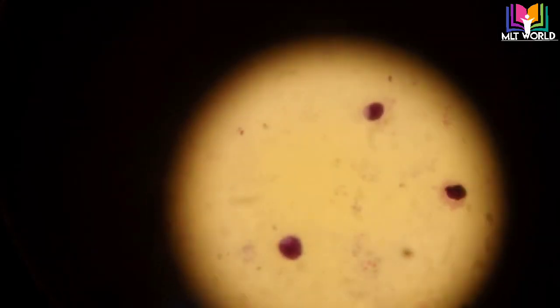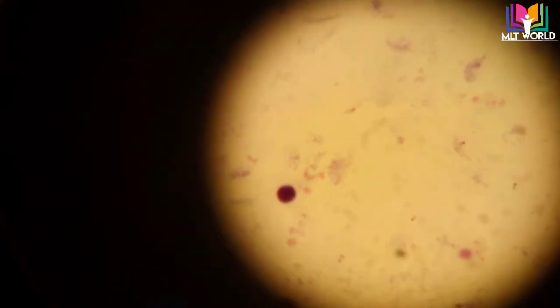I will try to show you some photos in the future for the thick smear. In the thick smear you will not find any RBCs — only white blood cells. You can also see malarial rings — small purple dots with a ring shape. In this field also there are more rings, but they are very small.